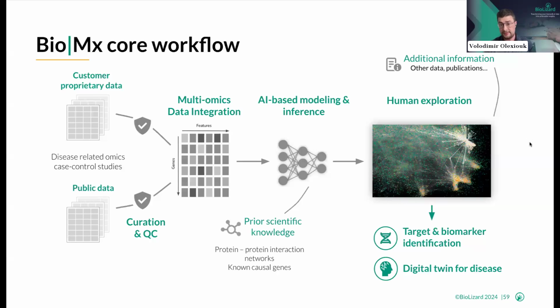The first one is obviously data integration. So certainly when you work with different omics, different technology, data integration is key. Not a topic that I want to focus upon right now, but another important challenge is actually to make sense from the data. So when you combine all those different data resources, you get so much valuable data that you really need to leverage AI analytical tools to guide researchers and scientists to what is truly important and towards the most interesting trends within your data.